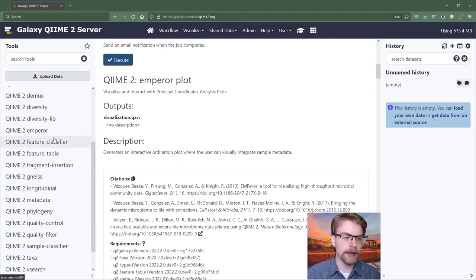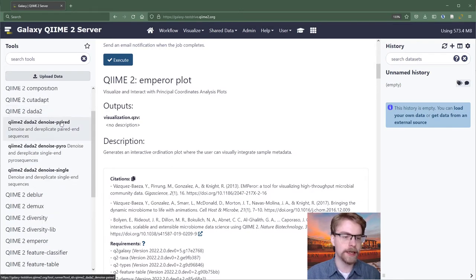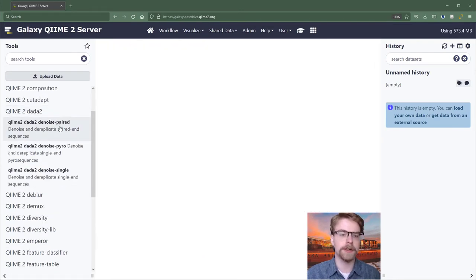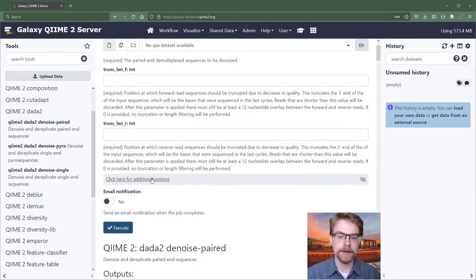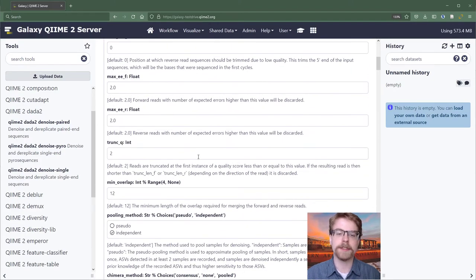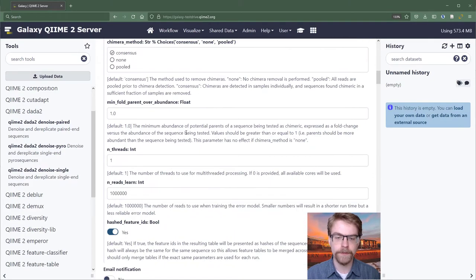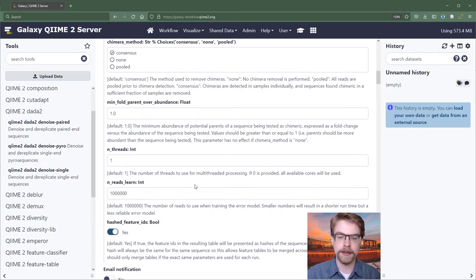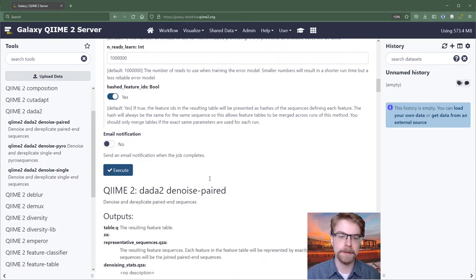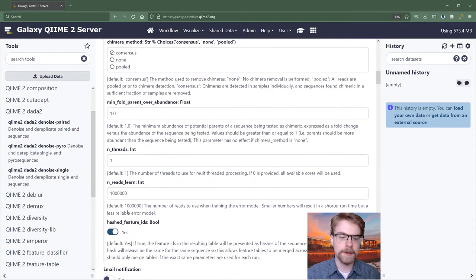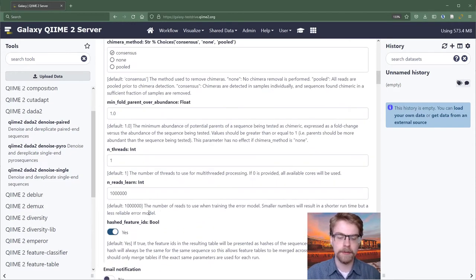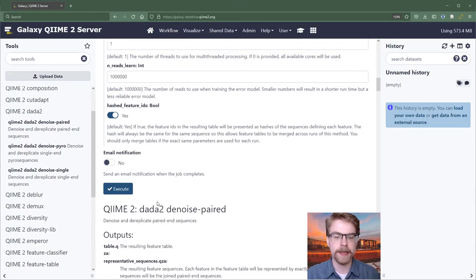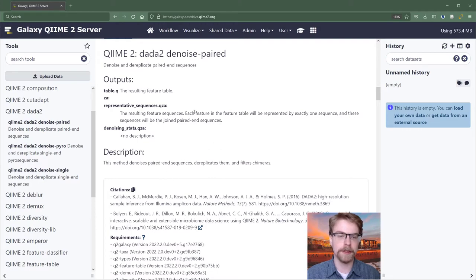If we look at a more complicated one, let's say, DADA2 Denoise Paired, we see there's a lot more options here and a lot more information. So it's always good to read and try and understand what exactly all these parameters are doing, especially even the default parameters. While those may be already set, it can be helpful to know at least what assumptions the tool is making. You can also read the descriptions and what kinds of outputs you will have.